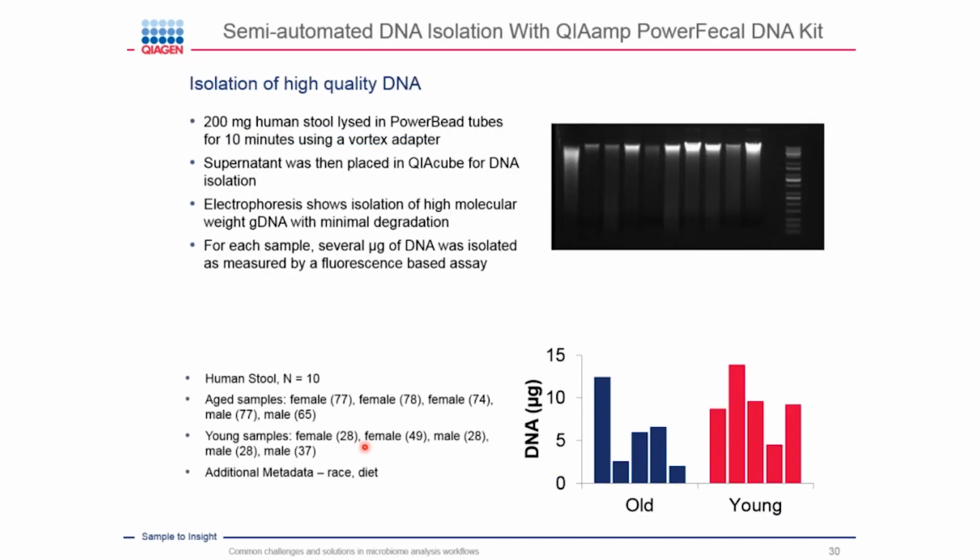We used stool samples from 10 persons. 5 of them are in a higher age, 5 of them are in a lower age. As you can see, the distribution was roughly 50-50 between male and female.